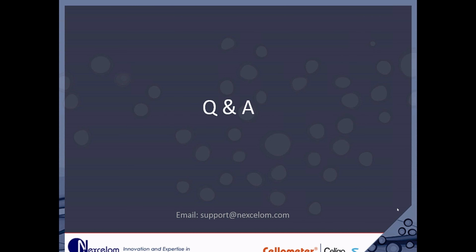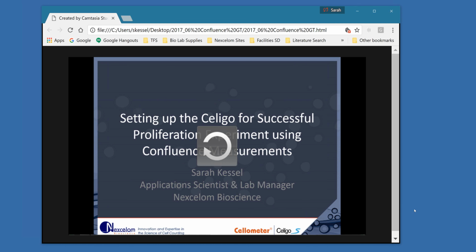I do want to make a comment. So I basically talked about a lot of different algorithms: bright field counting, fluorescence, dark field, and texture. Today we covered the texture algorithm, but the way I was teaching you how to acquire the images with the focus offset allows you to count the cells in early time points if you wanted to do cell counting. But I showed you that algorithm confluence texture works on those bright field images. So you could analyze it in either way, direct cell counting or confluence. I find that the confluence works easier when the cells are really overgrown, almost 100%.